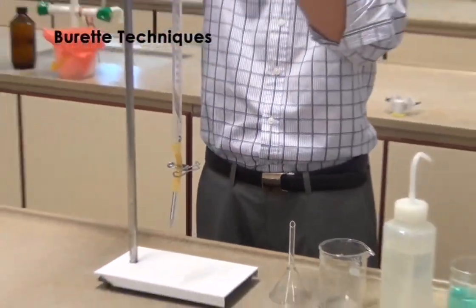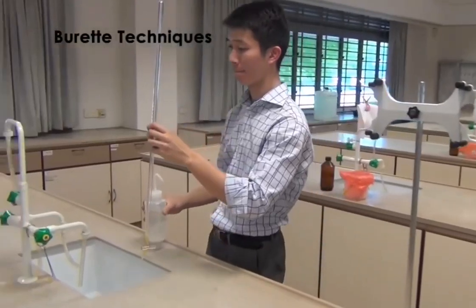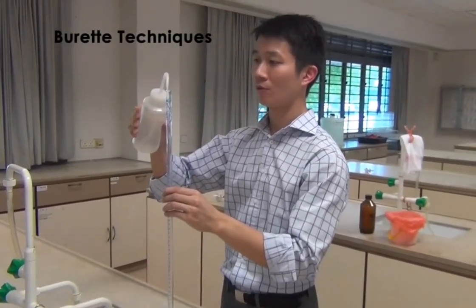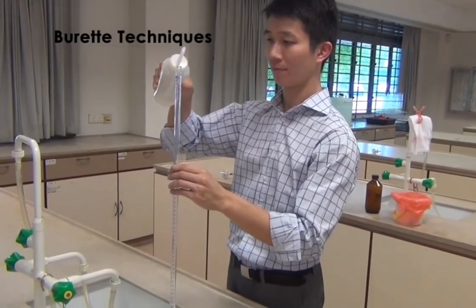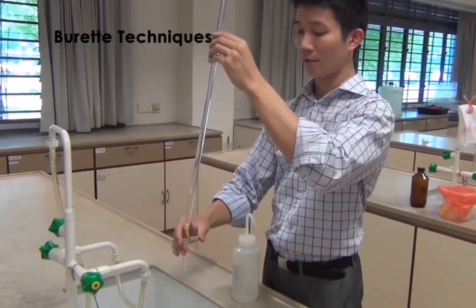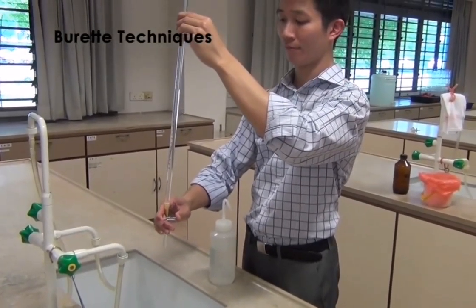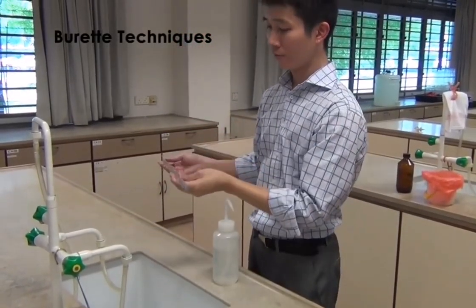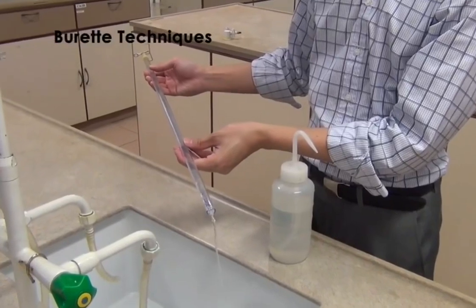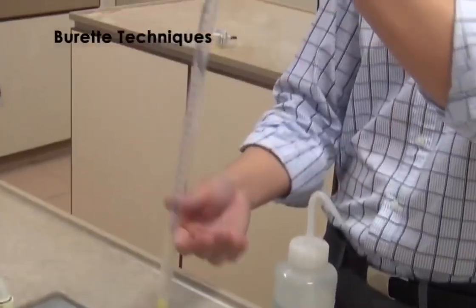Once done, you will now proceed to rinse the burette with deionized water. Ensure that all rinsing takes place in the basin. Fill the burette with deionized water and allow the deionized water to run through the tip of the burette by opening the clip. Once that is done, proceed to clean the top part of the burette. While washing the top part of the burette, roll the burette to allow deionized water to clean the burette thoroughly. Repeat this procedure two times.